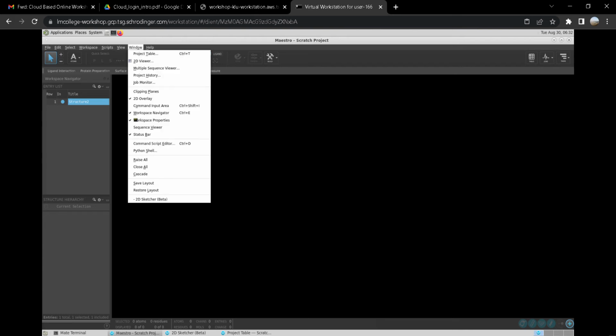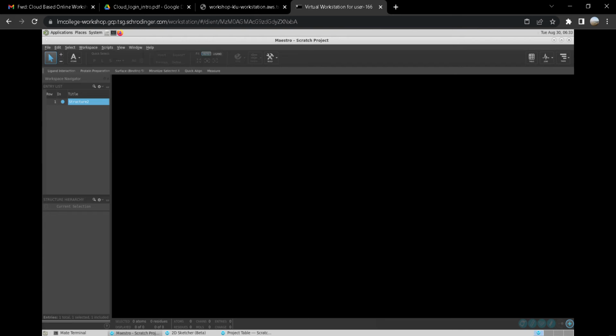But what you have asked is to add something custom, right? Custom-based groups. Yes, sir. I have to check that, but I'm very sure most of your fragments are well covered here. For example, specific metals and all that, you can access from here. Can you see? The carbon is there, and here you can see the full periodic table. Not only that, in More you get a lot of other options.